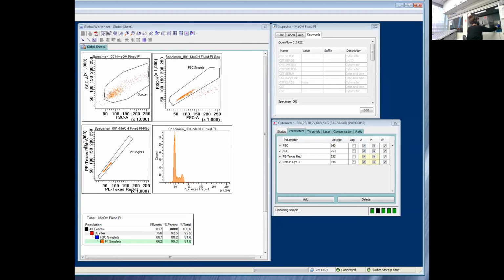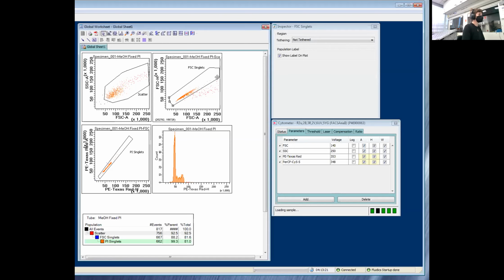Now, for today, we do have a variety of samples to run. So this is our optimized ideal sample with the preferred fixation of our alcohol fixation. As I'm reloading the sample, Derek, are there any questions that have come through up until this point? Sorry, I have to unmute before I can say that. Not at the moment.